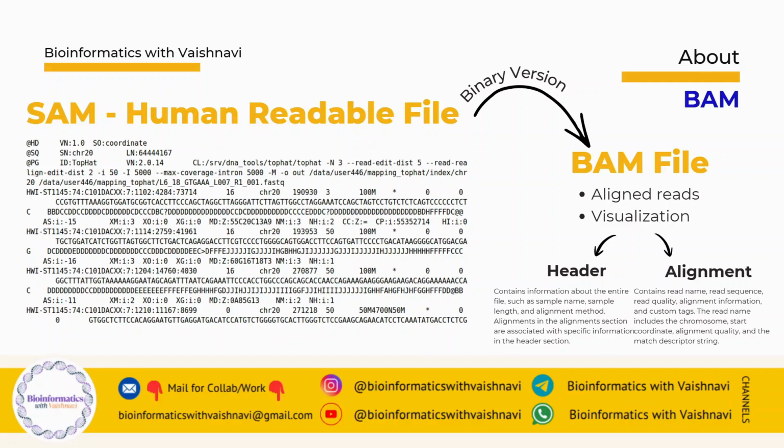Now, one of the major questions most interviewers ask: have you ever visualized a BAM file? If yes, please interpret it. So देखो BAM फाइल को विजुलाइज करने के लिए वैसे तो ये ह्यूमन रीडेबल नहीं होती है बट हम इसे विजुलाइज करते हैं थ्रू आईजीवी। इसके लिए मैं एक सेपरेट वीडियो बनाने वाली हूँ सो दैट यू कैन अंडरस्टैंड हाउ टू विजुलाइज अ BAM फाइल एंड दिस विल आल्सो हेल्प यू इन द इंटरव्यूज। So basically BAM files are compressed, efficient, and used in almost every downstream analysis.